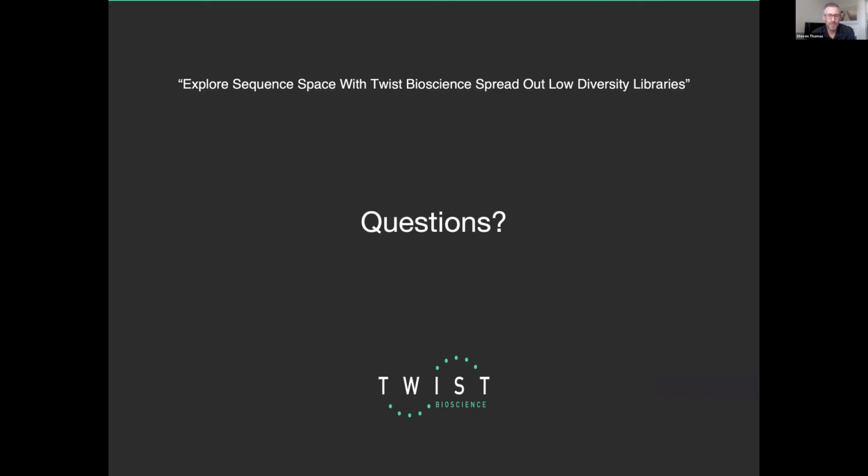Just one more. So here's another question that's kind of interesting. Can you get a small library, for example, 384 variants, as separate variants rather than a mix? So again, I think we would work with the gene synthesis group to probably answer this question. Yeah, SOLD and CVL are all delivered as pools because they're built as pools, but site variant libraries are the only ones that can be delivered as individual variant sets. Right.